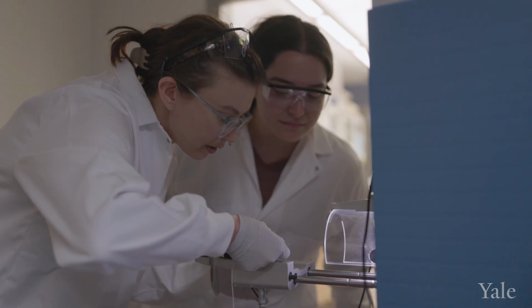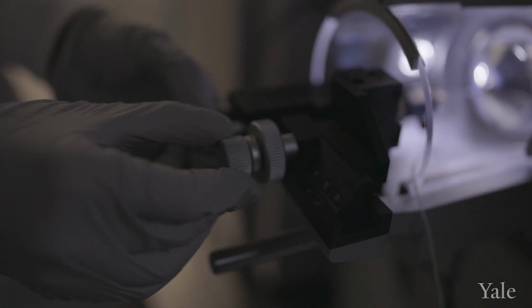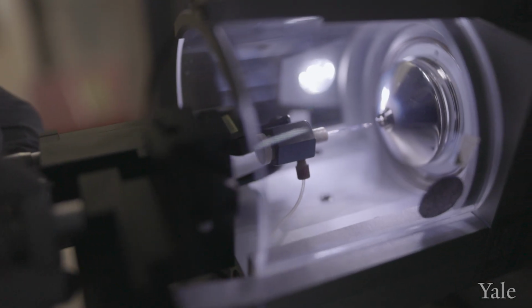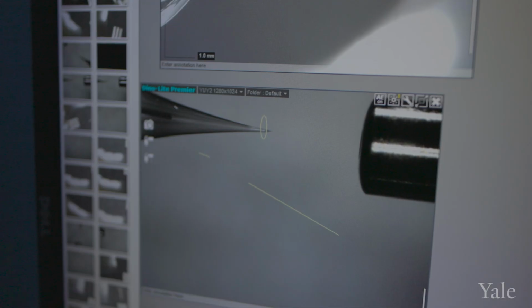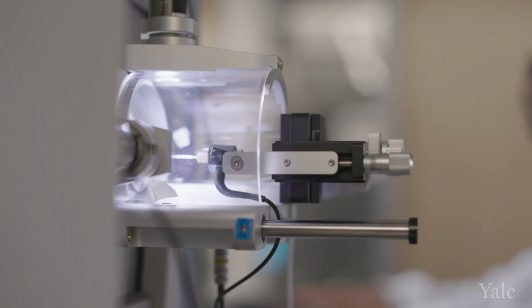Now, when you have done that, then you need molecular resolution to understand what are the molecules we have here. So that's where we use a lot of mass spectrometry. And all of that effectively gives you almost pixel by pixel information about what's the design principle of the cellular membranes that regulates its function and its ability to communicate with surroundings.